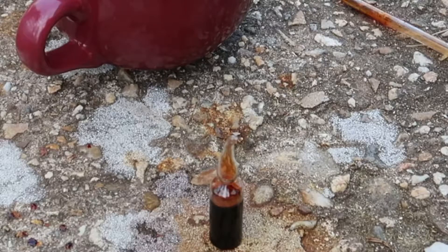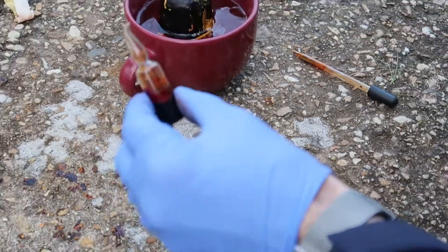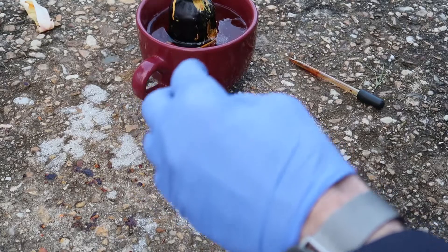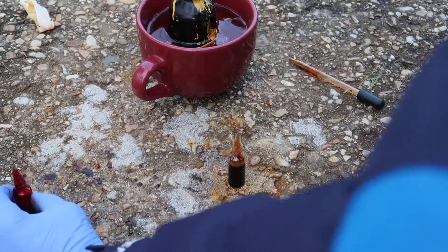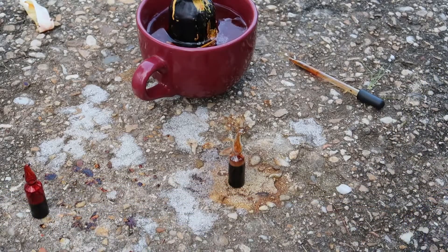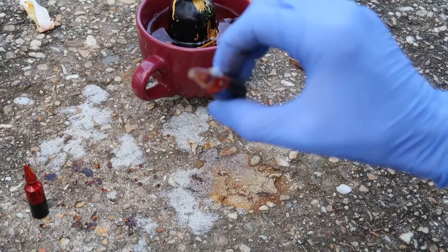That one is marginal. Incidentally, if this is cooled off enough we might be able to test it for leaks. If you hold it upside down, it looks like it's not leaking out, so that's good.